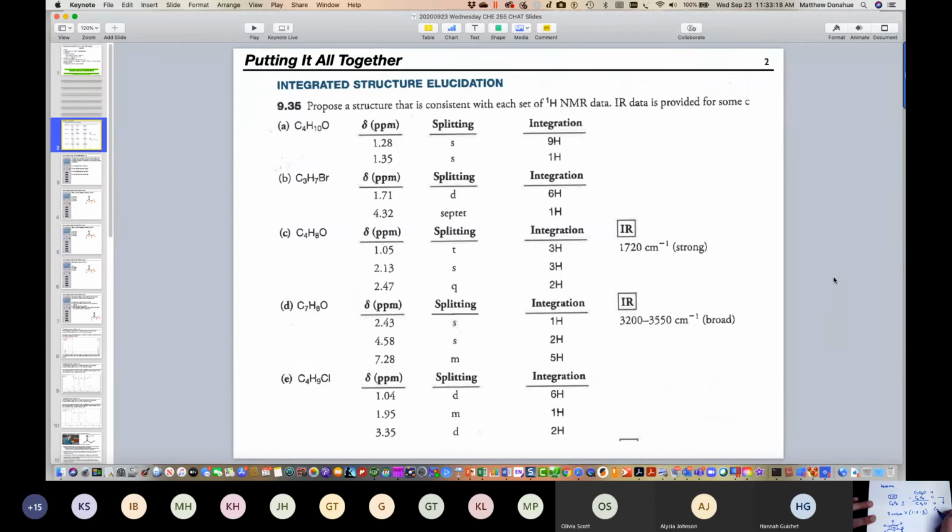So our revision, C7H8O, C6H5, that was 4 degrees of unsaturation. So that gets us C1H3O, which has no degrees of unsaturation. So we have to put these elements in a fragment that match. So there's 3 hydrogens here, right? We have 1, 2, 3 total to account for. So now we have to figure out how these are bonded and stick it on there to come up with our claim.